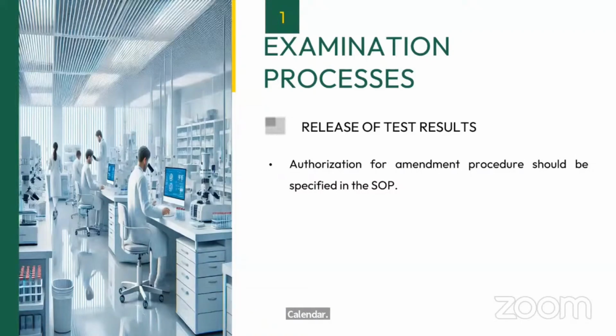So you must have a procedure in place for whenever you require to make any changes to the report or edit it. Many times, most of the time for histopathological cases, we have typed the report, the authorized signatory has signed it, and after that somebody remembers that there was some spelling mistake.